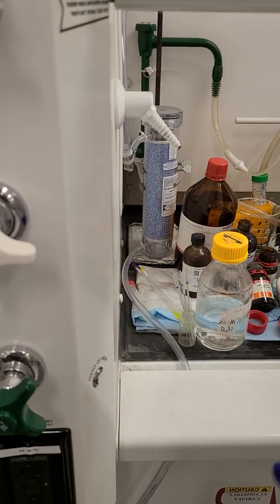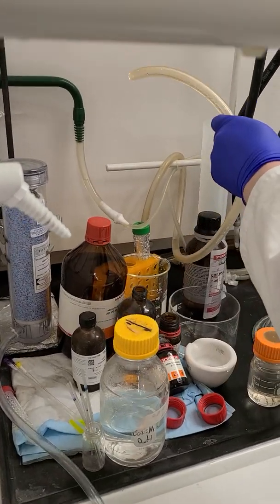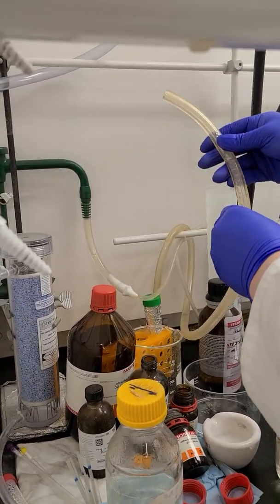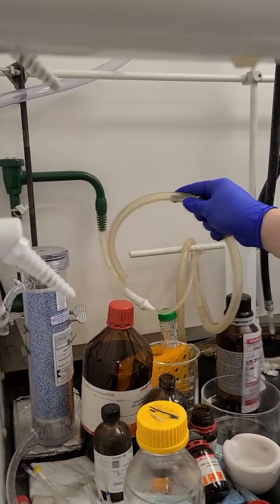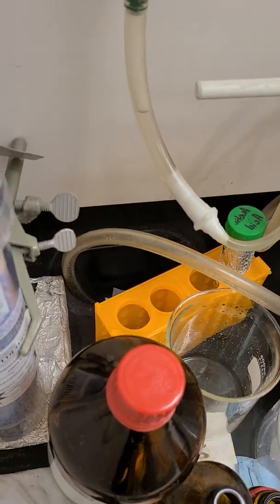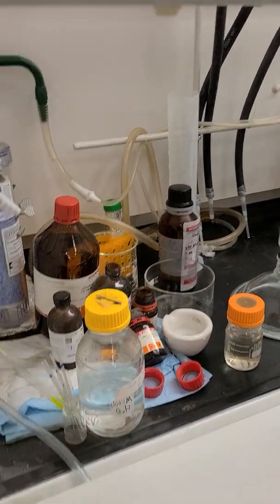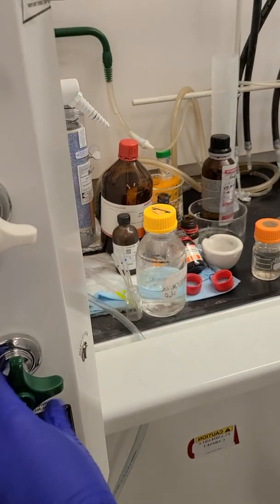Before you turn on the water at all, the water outlet that runs from the outlet of the condenser will run all the way along here. It's zap strap, so you don't have to worry about anything but the end. This end needs to be in, and I don't know if you can see it, but there's a sink back there. If it's not there, the water is going to flow into the fume hood and you're going to get a flooding situation. So now once that's in there, you can turn on the cold water.